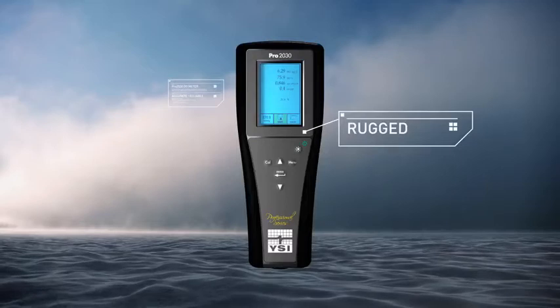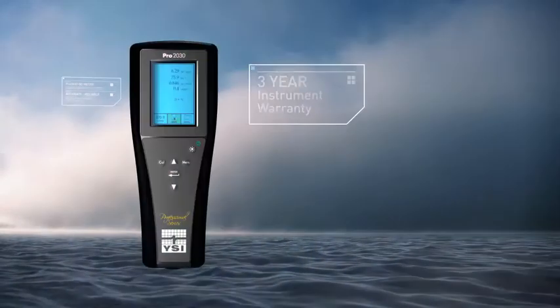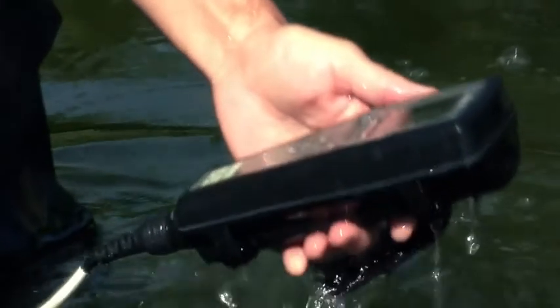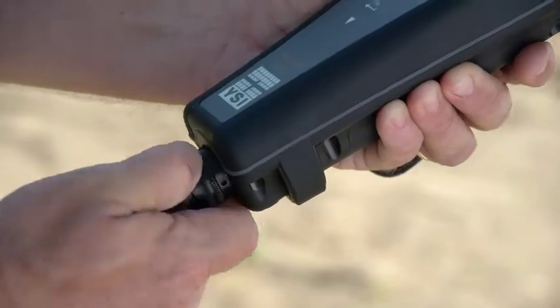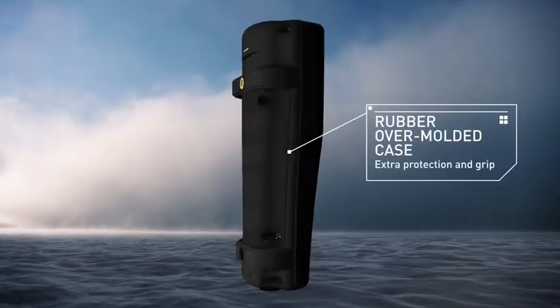YSI products are rugged, accurate, and reliable. And all PRO series instruments include a 3-year instrument warranty, 2-year cable warranty, IP67 waterproof rating, rugged military spec connectors on all meters, 1-meter drop test rating, and a rubber-over molded case.